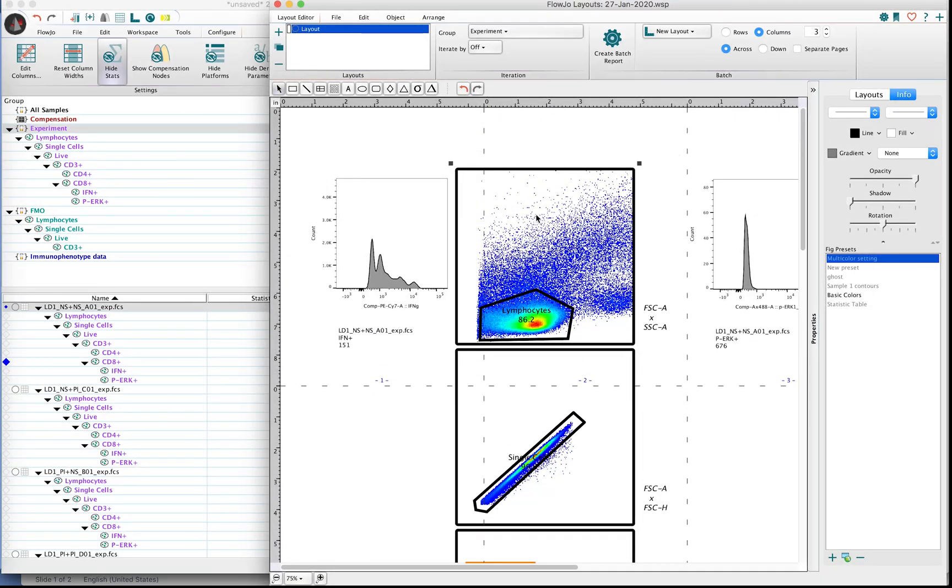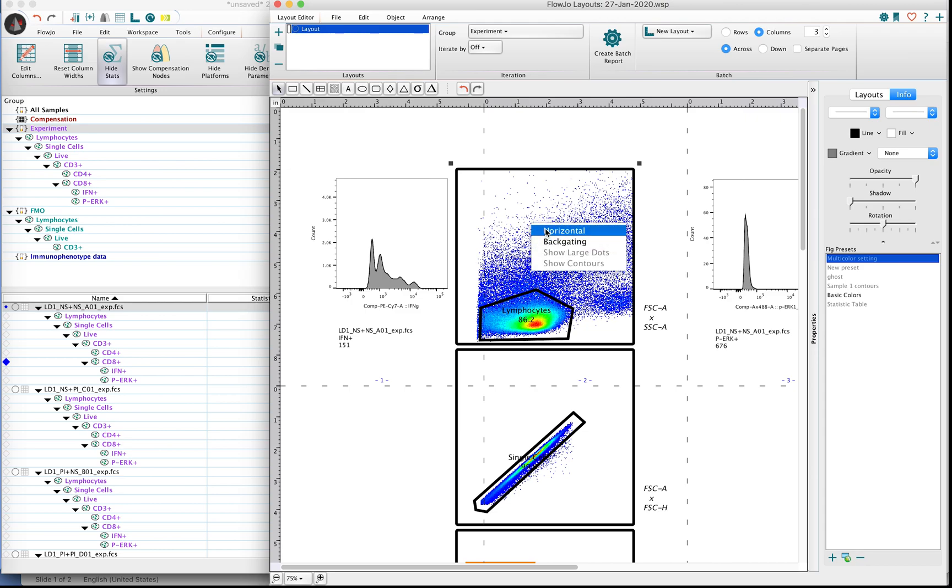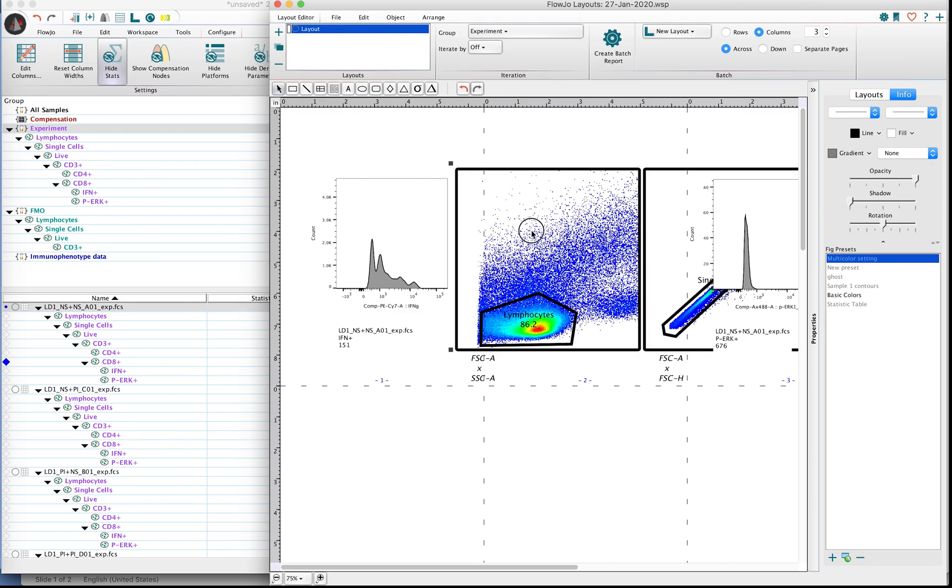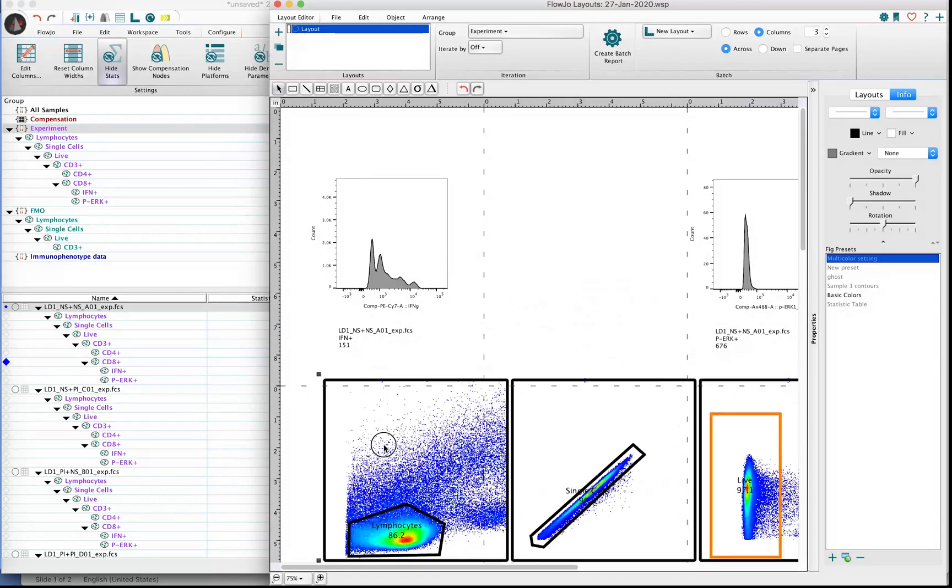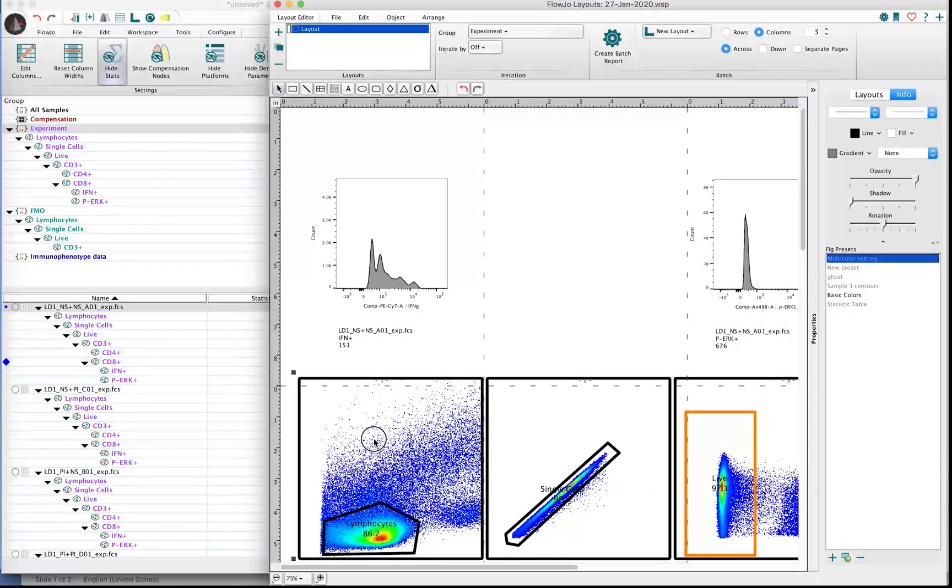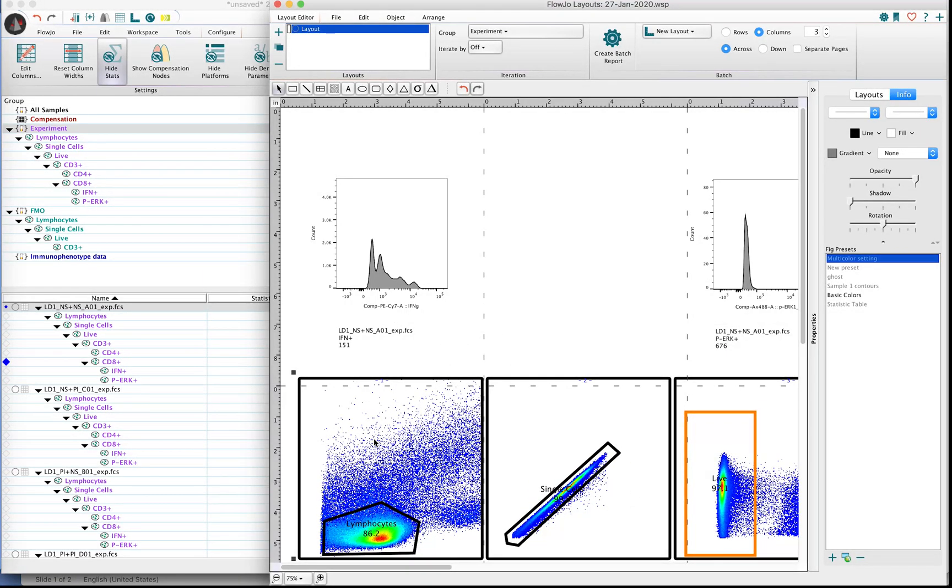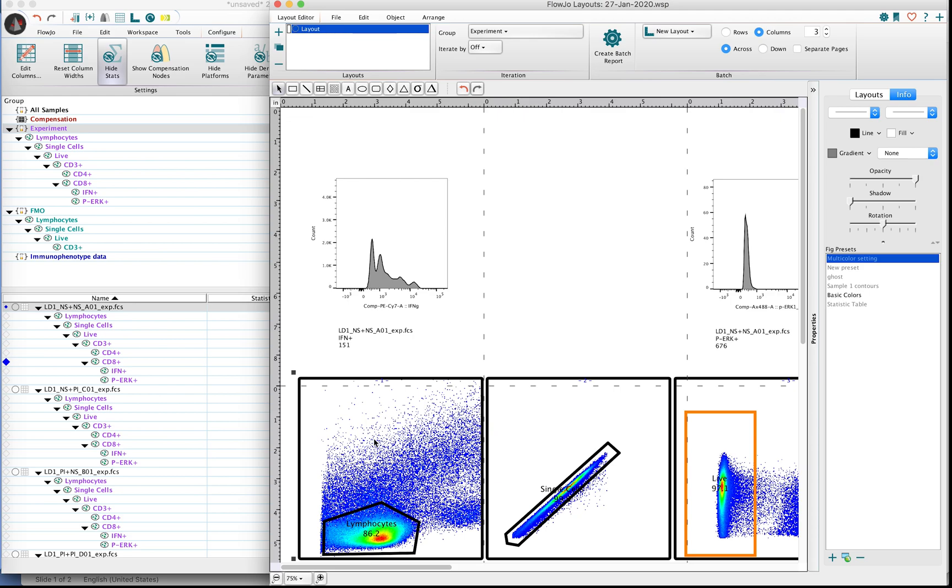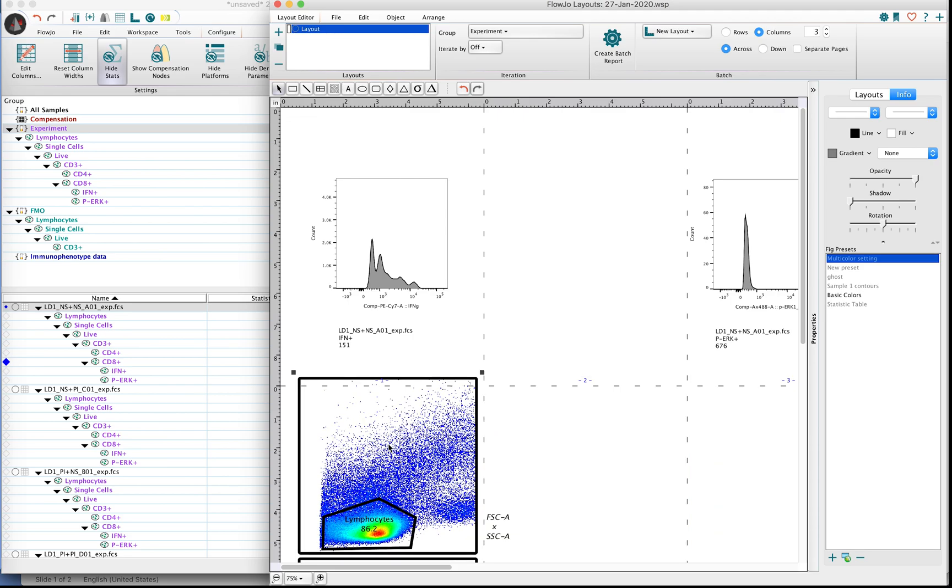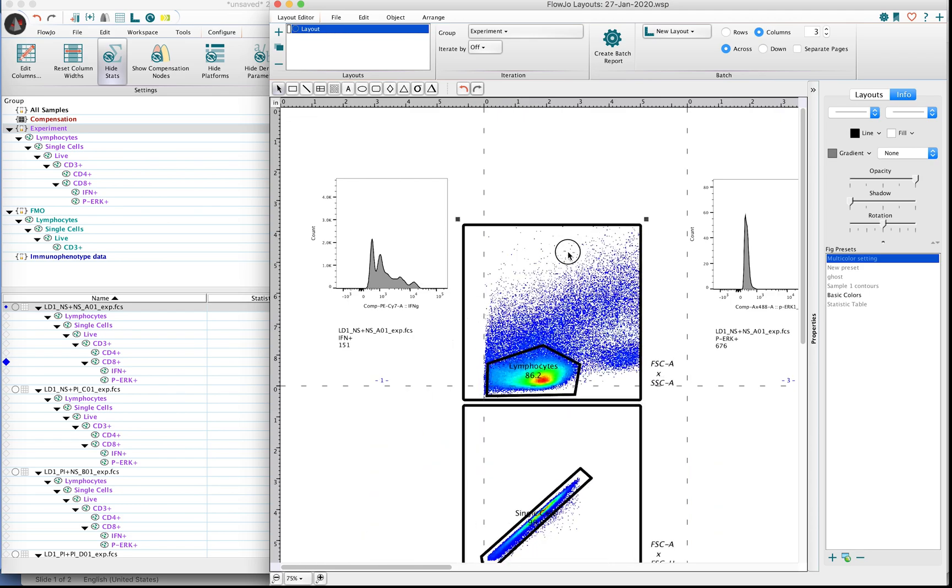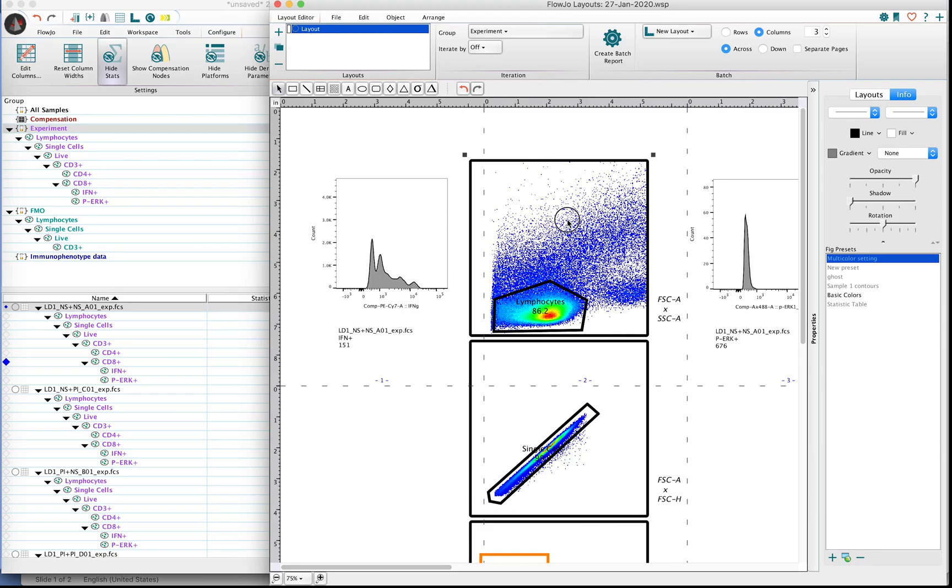Now the Ancestry panel here, you can arrange this in two different ways. You can either make it go horizontal or vertical. So I just had it in the vertical position, and I'm moving it over to the horizontal. And we'll make it go vertical again, just for example's sake.